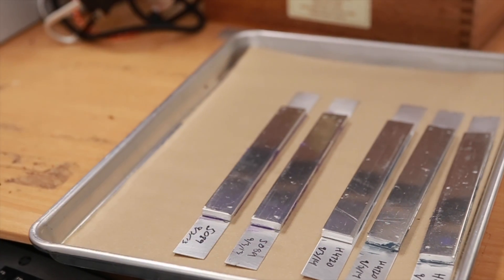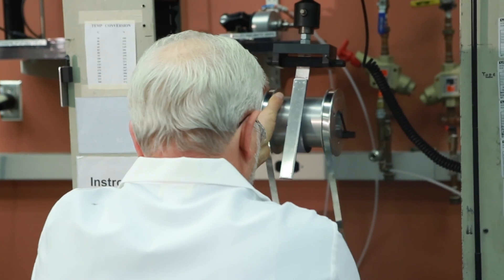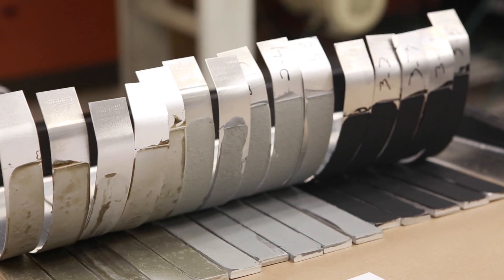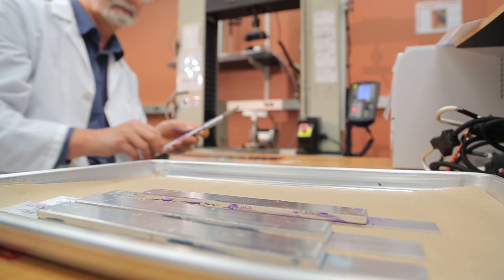These tests are important for describing assemblies where the bond is subjected to peel loads. All of the applied load is concentrated on the leading edge of the adhesive rather than across the entire bonded area.